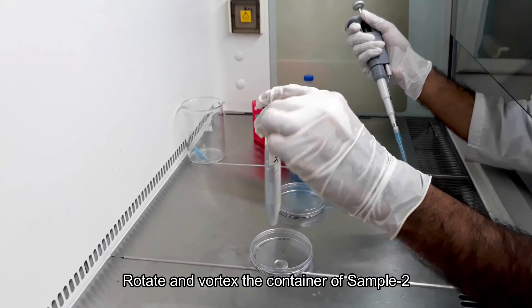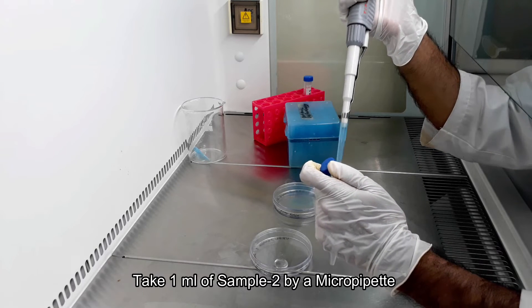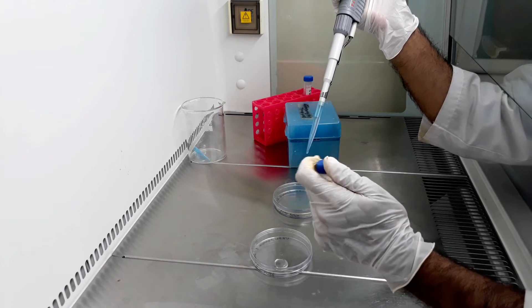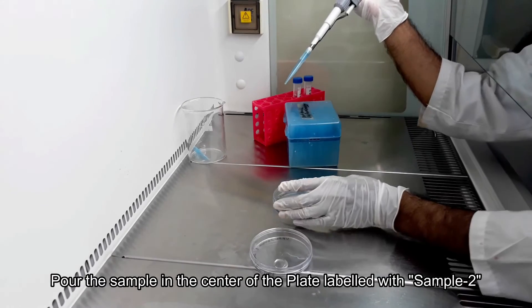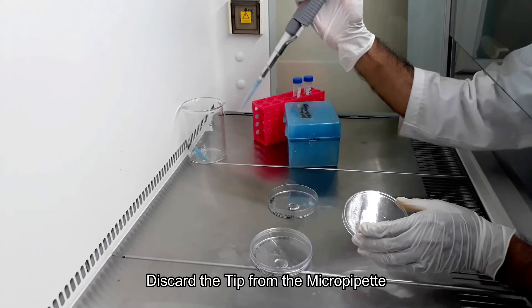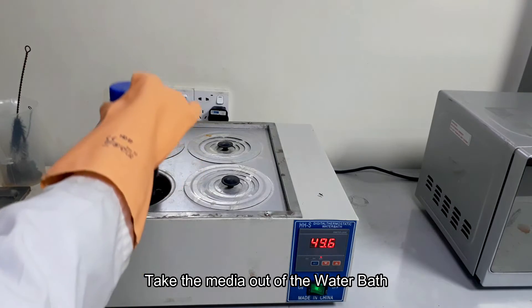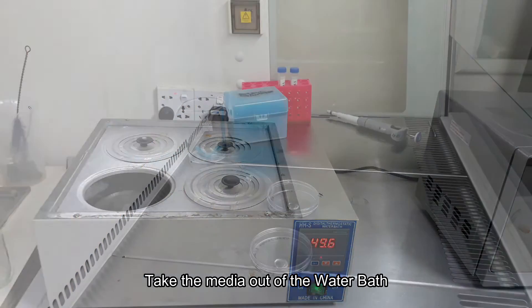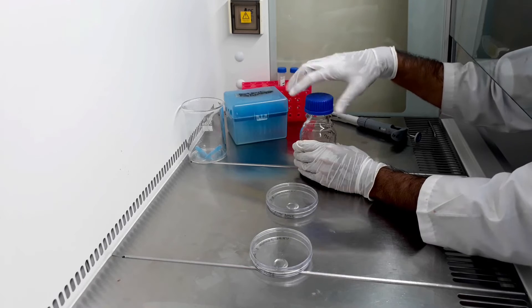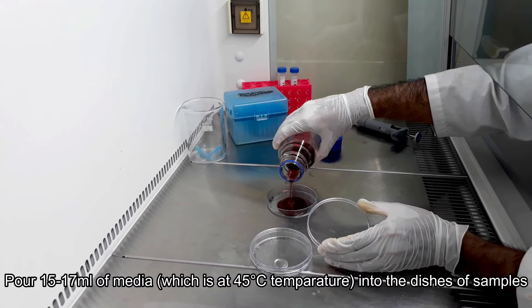Do the same thing for taking sample 2 on the second petri dish. Now, bring the sterile culture media and pour 15 to 17 ml of the media onto the sample.